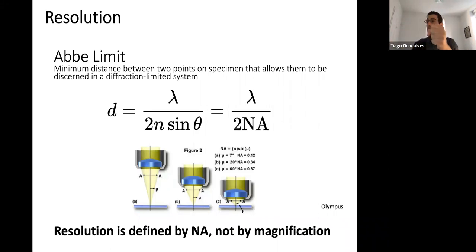It emits down into the mouse. It emits up to your microscope. It emits to the sides. And sometimes when you go next to your mouse, you see it. So it's emitting everywhere in all sorts of different directions. But you want to know how much light you are actually capturing with your objective? And the numerical aperture is a measure of that.